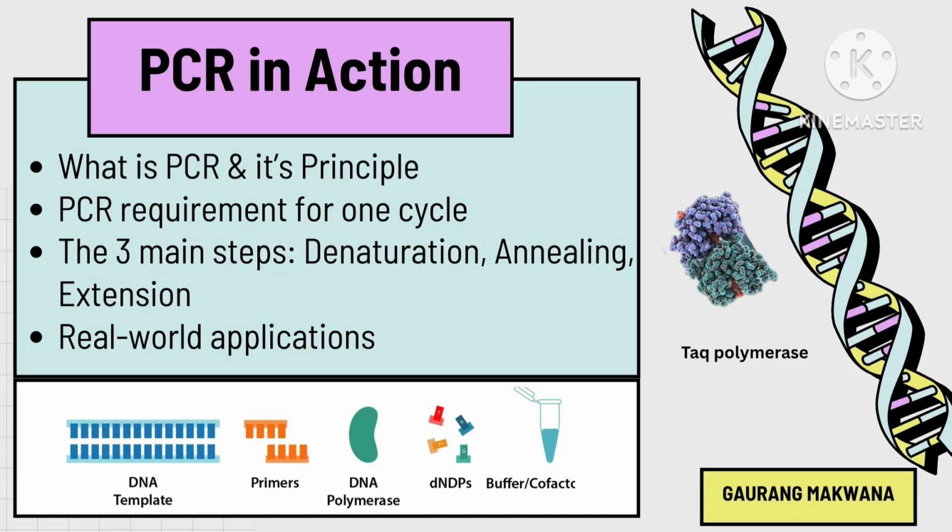So in this video lecture, I'll cover the introduction and history part, then the basic principle with the simplest understanding, then the requirements for performing the reaction, what the basic requirements are, then the steps involved to perform one complete cycle, and at the end, applications of polymerase chain reaction.